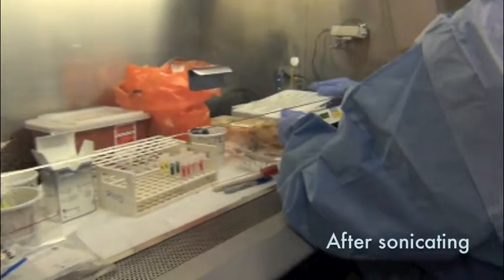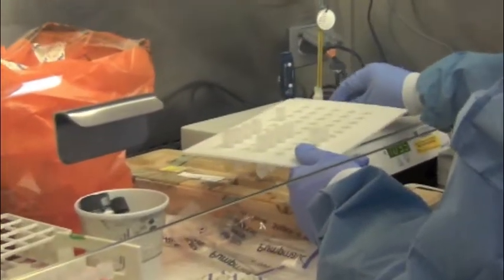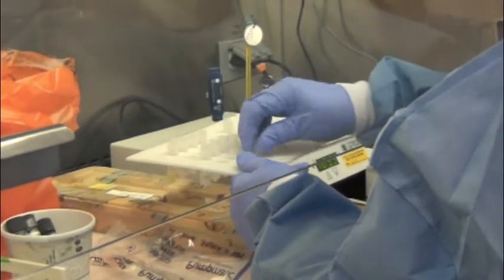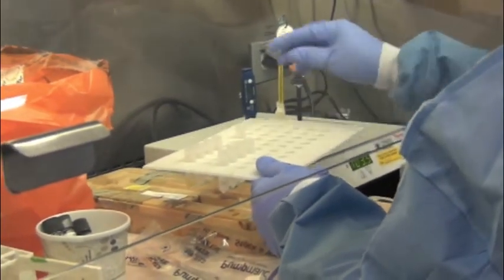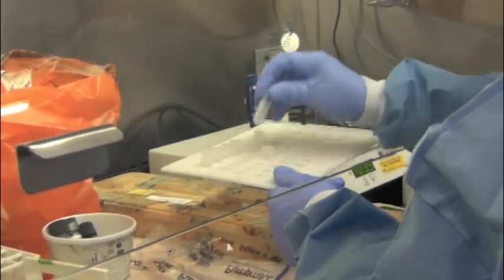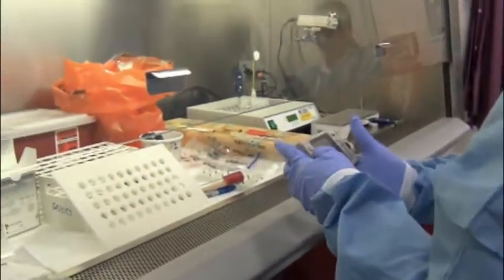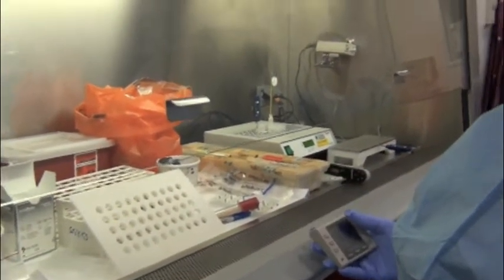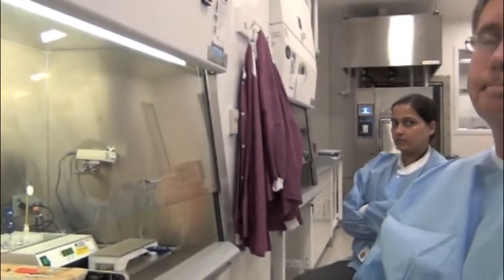We're going to put them in our 95 or 100 degree block. It's got to be at least 95 or greater to kill off the organism. So this is going to kill it and break up the DNA. This will go for 10 minutes. And then when we take it out of here, after 10 minutes, we'll put them in our probe tubes.